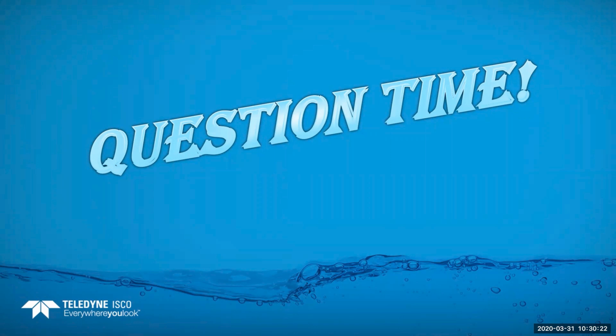There's different ways to accomplish that too. You can say, okay, each sample I take, instead of being 500 mils, I want each sample to be 400 mils, and then you'll get less volume in there as you go. It's kind of trial and error.